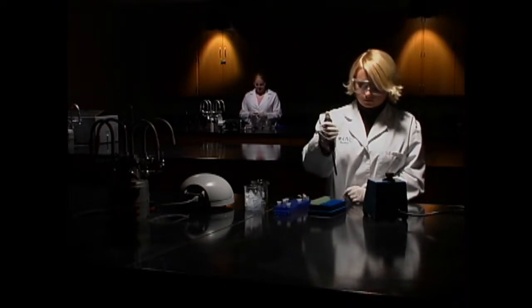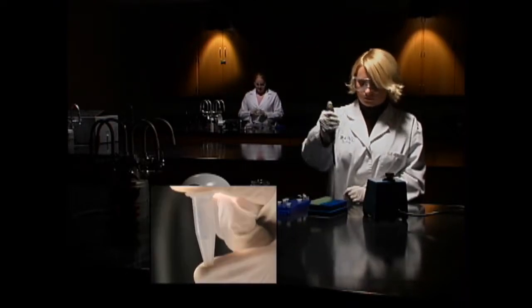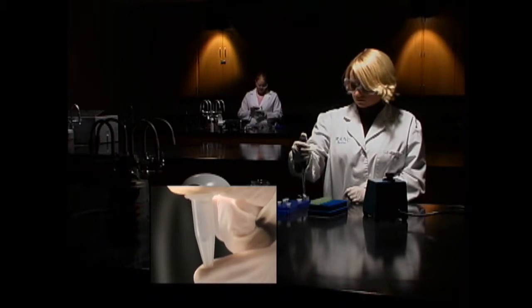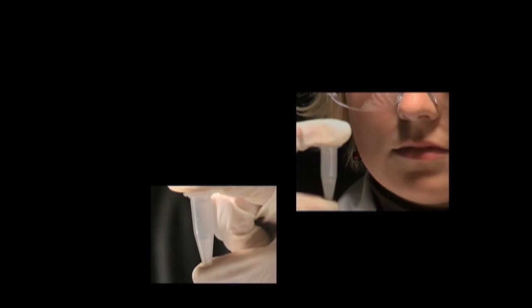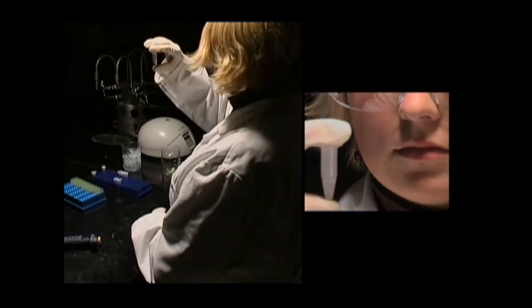Cap the tube again and mix it thoroughly. You should see a white precipitate form. This precipitate is made up of SDS, cell membrane fragments, proteins, and large amounts of chromosomal DNA, which is attached to the membrane fragments.